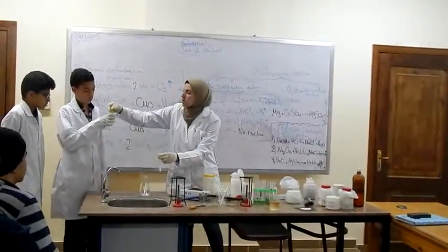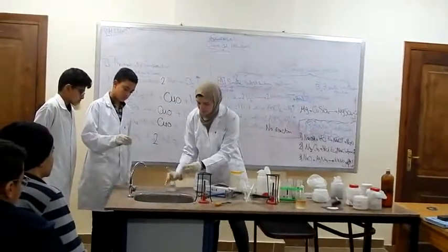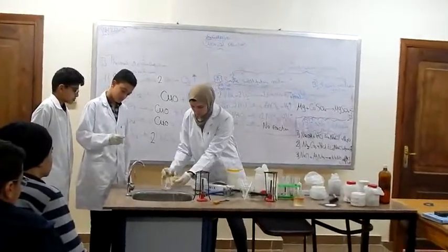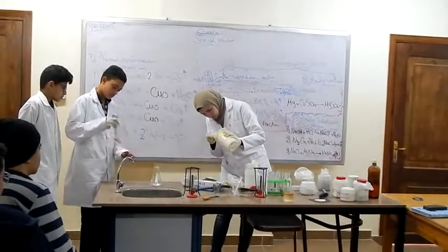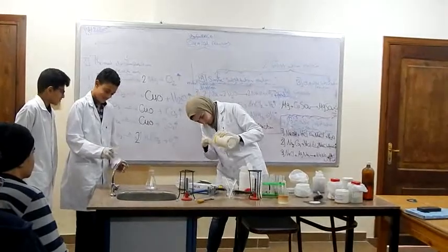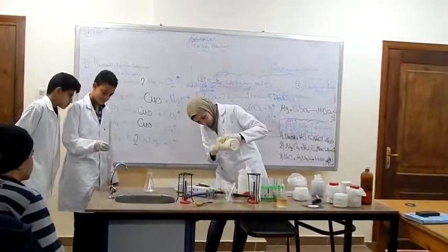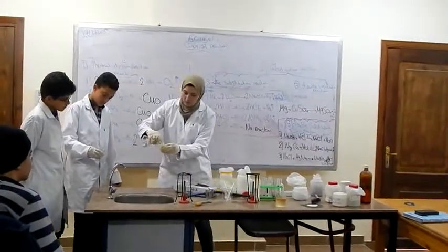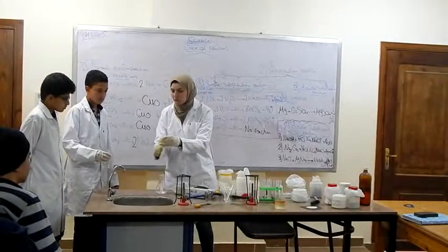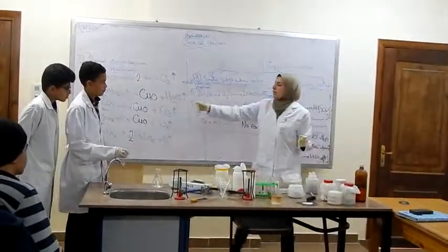This is the sodium nitrate solution. Now take sodium chloride and silver nitrate.